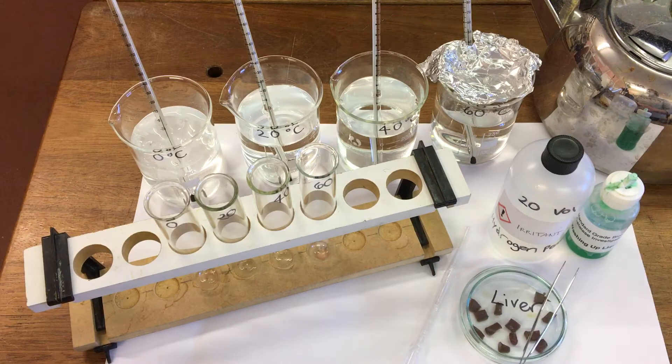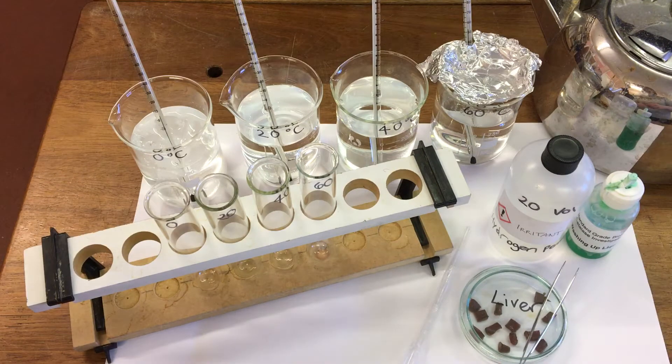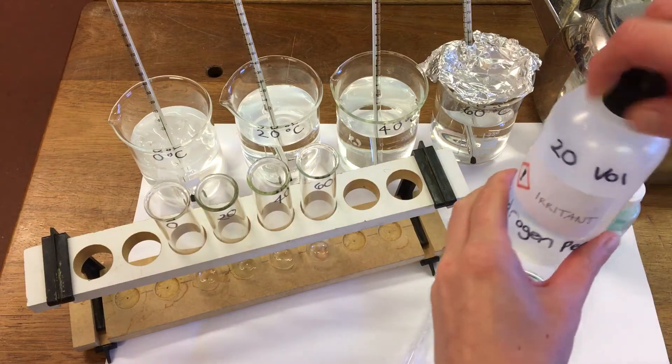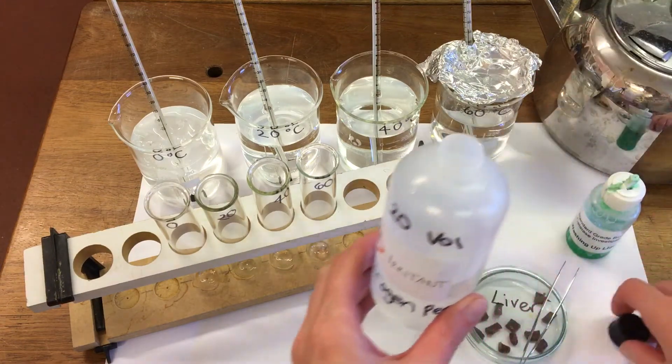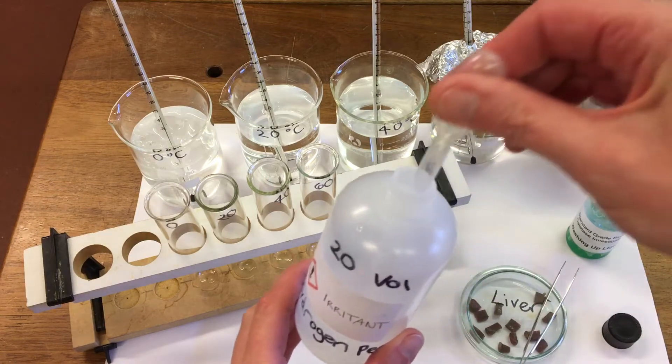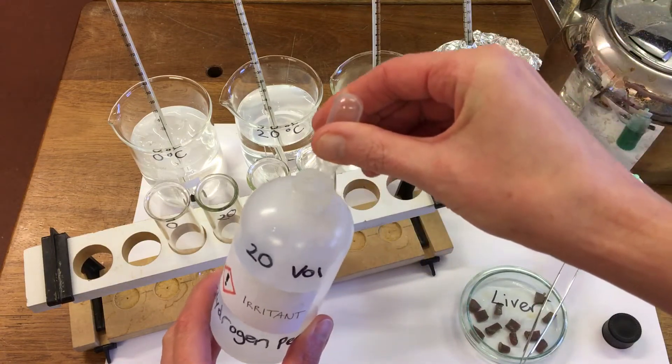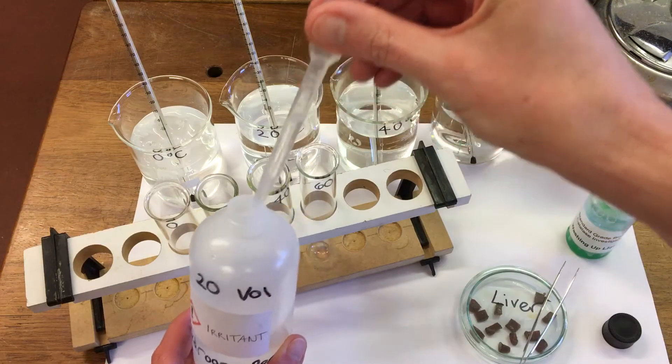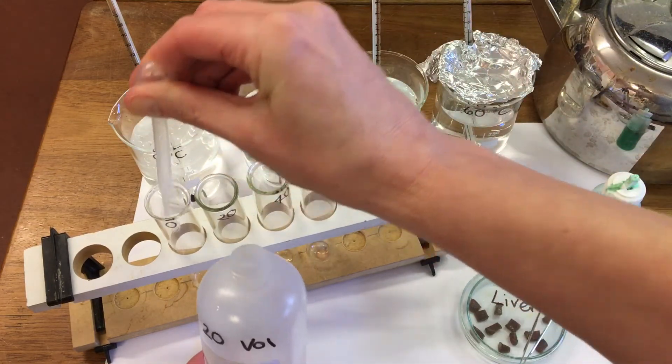So first of all I'm going to take our hydrogen peroxide and I'm going to put it at four different temperatures. We're using 20-volume hydrogen peroxide and I'm going to take two mLs into each of our test tubes.